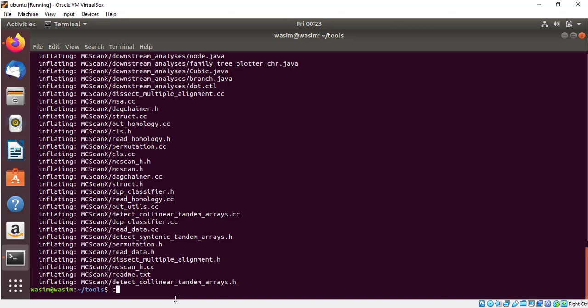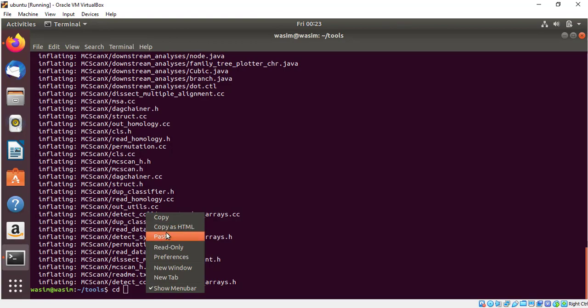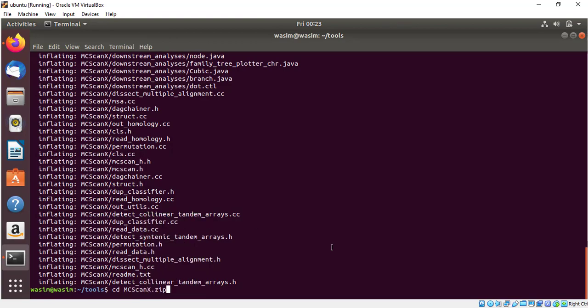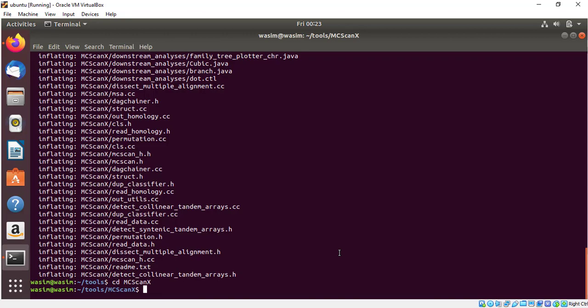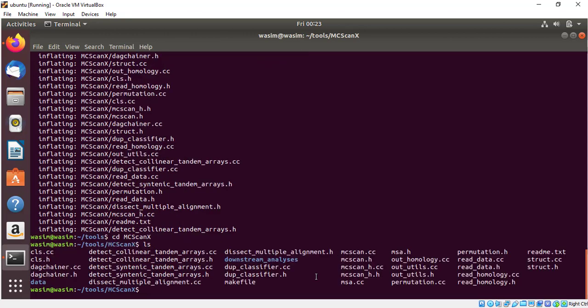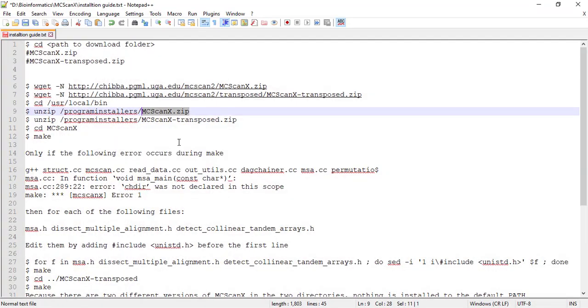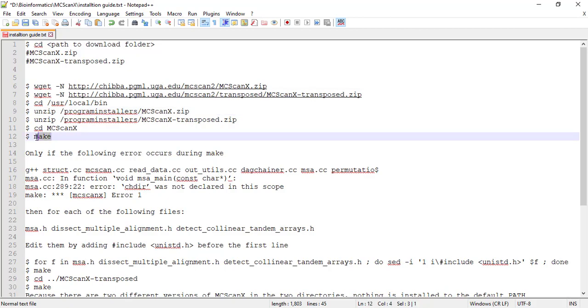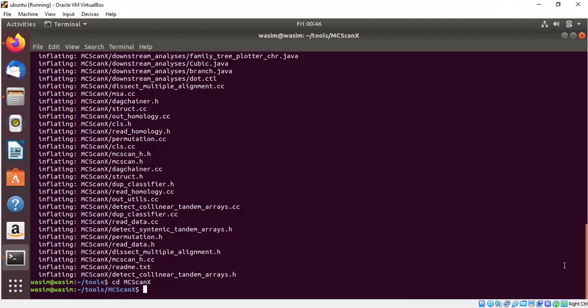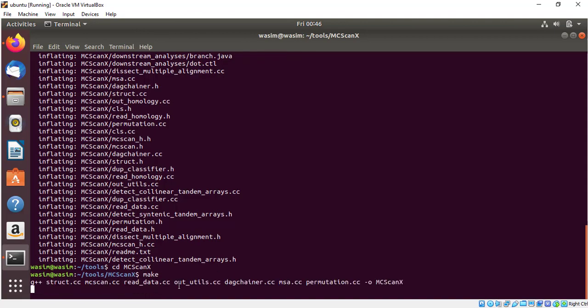After that I will go to MCSCANX folder. Here you will see some files. Now we need to install this file. First step finished. We will type cd MCSCANX. Now we are in MCSCANX folder. After that we will type make in MCSCANX folder. Type make and wait for it to install.